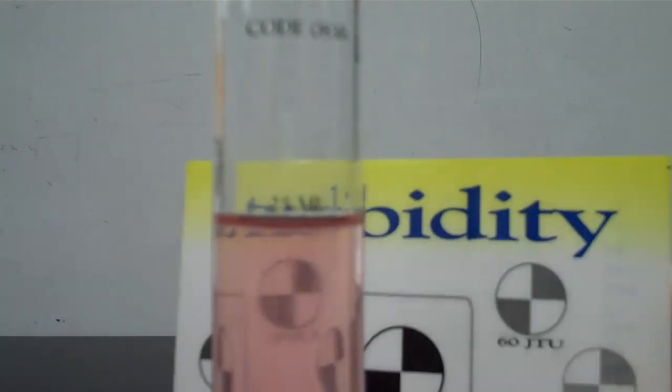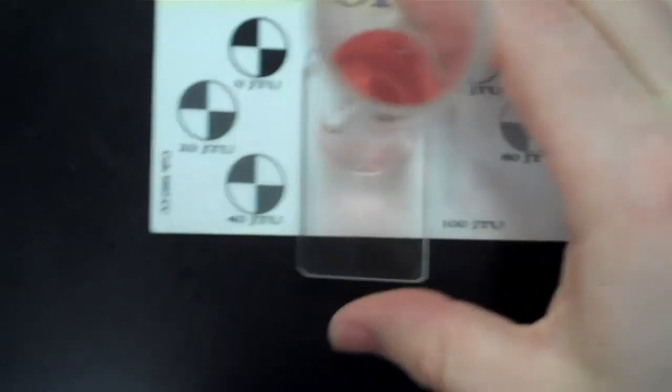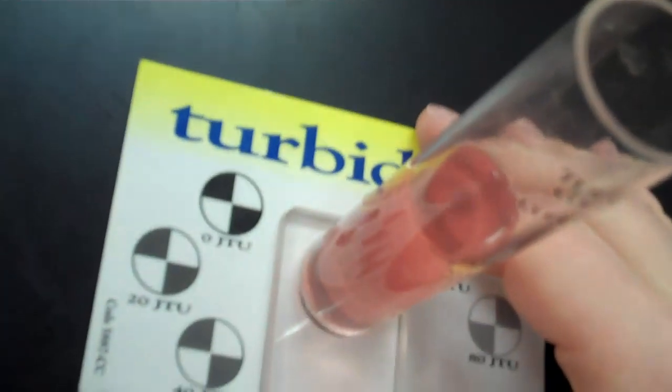Looking at it from the side, that's pretty close. The next step is you're going to need one of these turbidity cards and put that flat on the desk. Then you're going to line up—there is a gray rectangle.